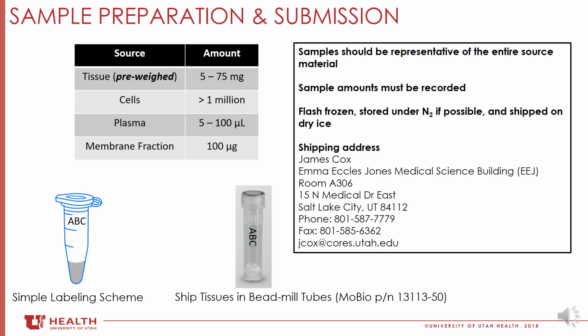If possible, researchers should generate a blank or negative control sample in their set. We also request that researchers ship their pre-weighed tissues in the bead mill tubes shown here.